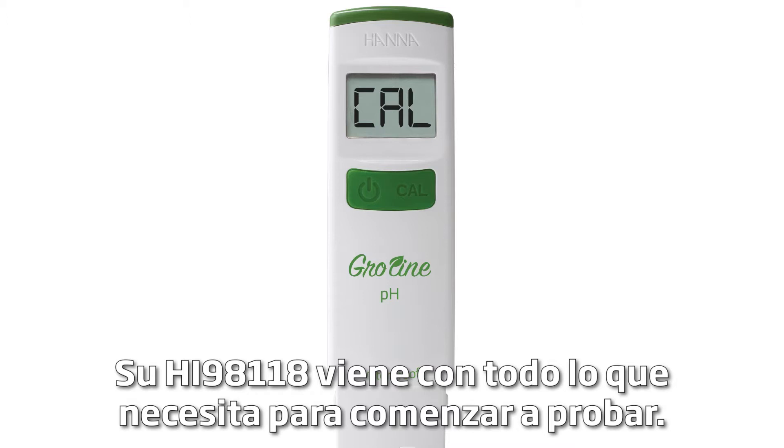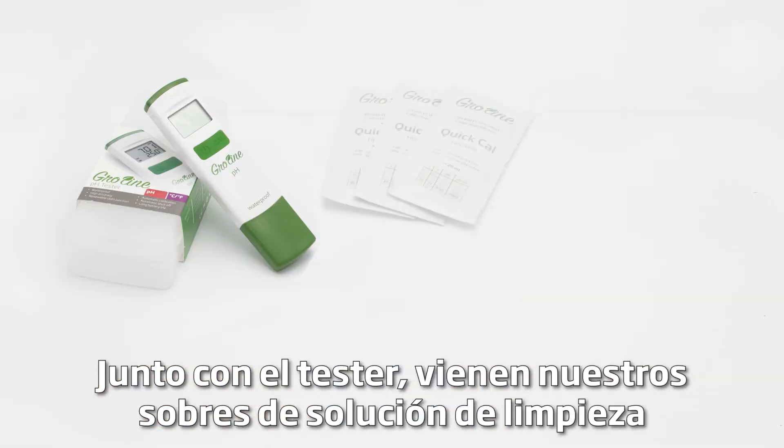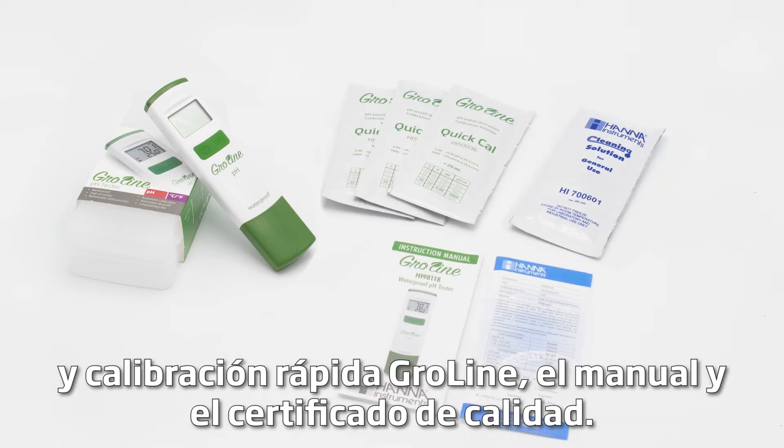Your HI-98118 comes with everything you need to begin testing. Along with the tester comes our Growline Quick Calibration and Cleaning Solution packets, the manual, and quality certificate.